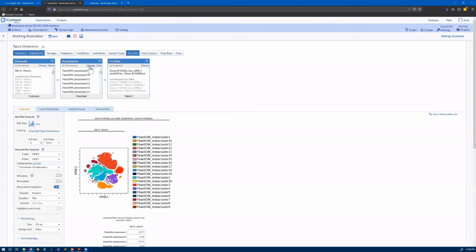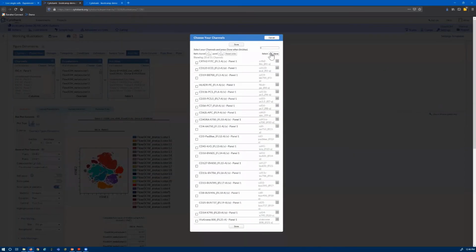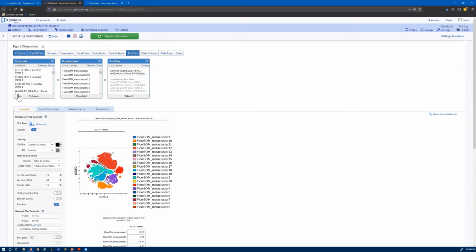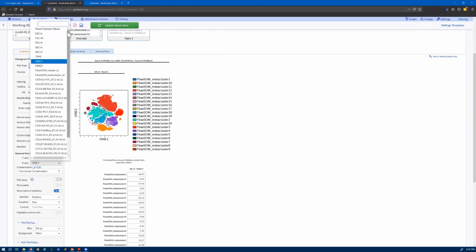So either you can take a look at all of the metaclusters and all of the channels at once. That's a little overwhelming, and you have a lot of metaclusters and a lot of channels. I'll show you what that looks like. You can do this with histograms or heat maps. So I selected all of the channels I want to look at, all of the metaclusters, and I'll just select one of my 3 samples for now. I'll make histograms, I'll overlay them, and then down here, I'll make my curve smooth and just select which channels to plot.